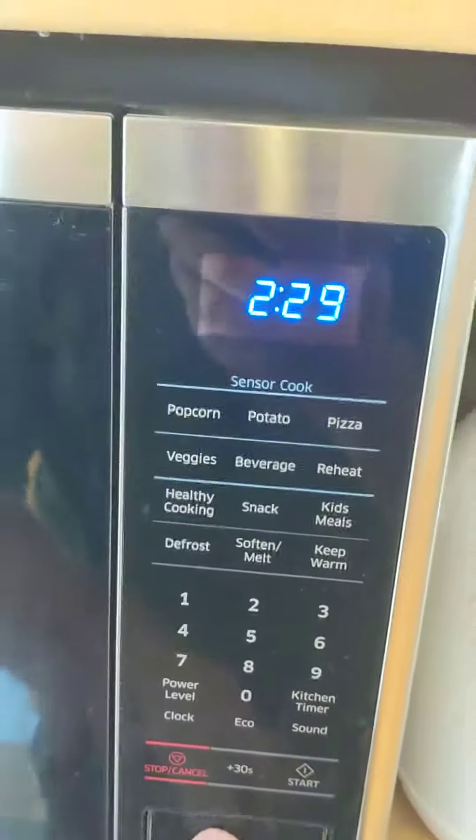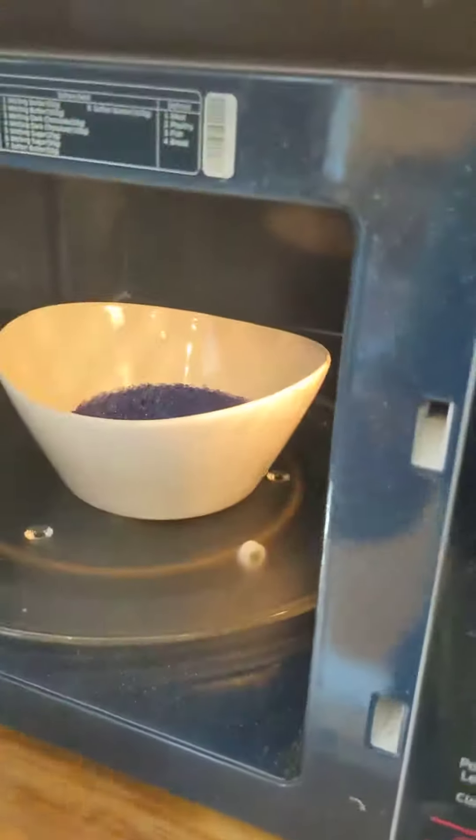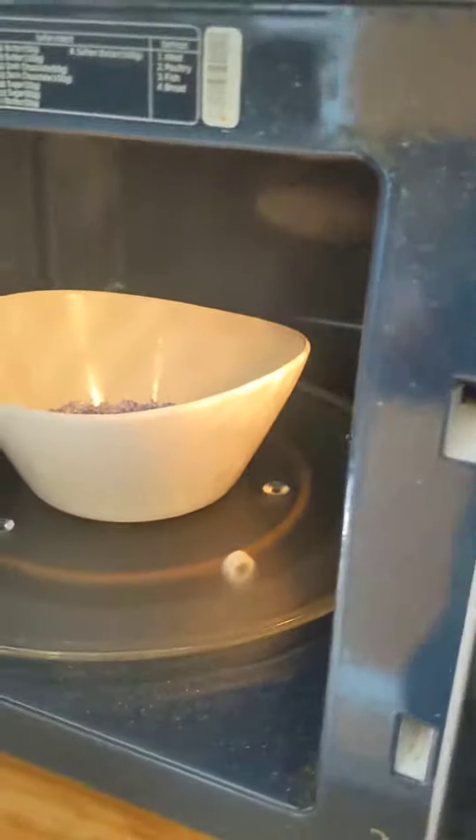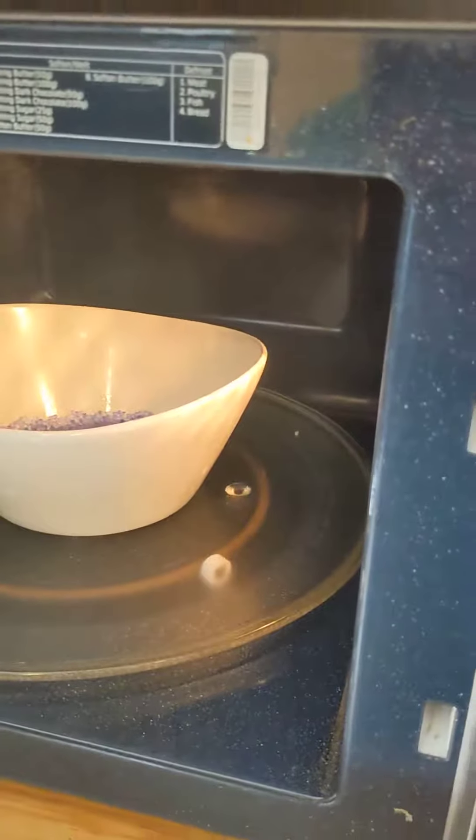As it regenerates it takes on its original color and the moisture is heated off.